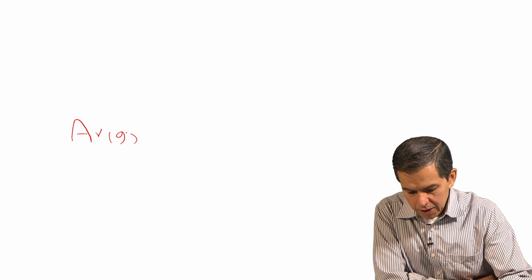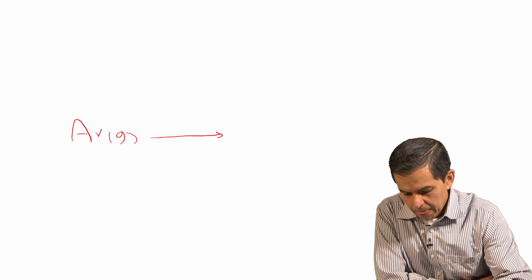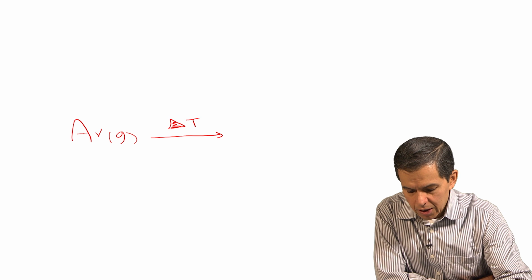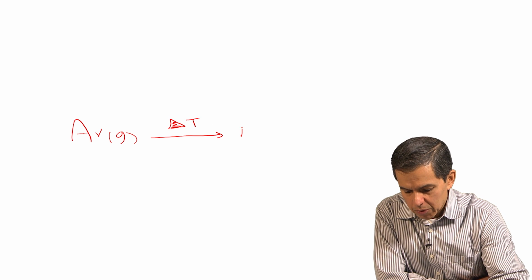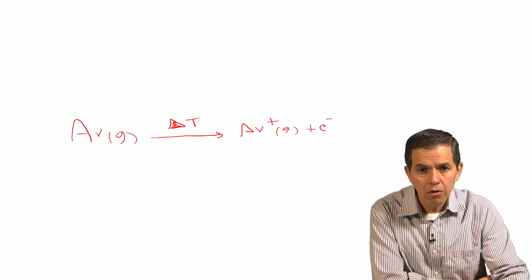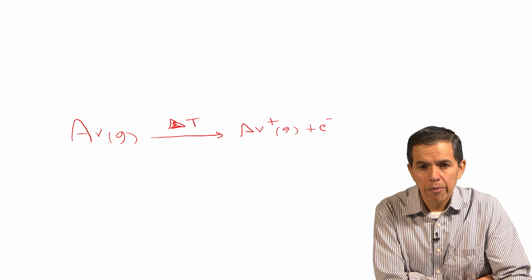One of the basic principles of the ICP torch is the chemical reaction that leads to the formation of argon ions. This reaction consists of argon in the gas phase, provided with high temperature and additional energy, resulting in the production of an argon ion plus an electron. This basic reaction is the one that will lead to the formation of plasma.